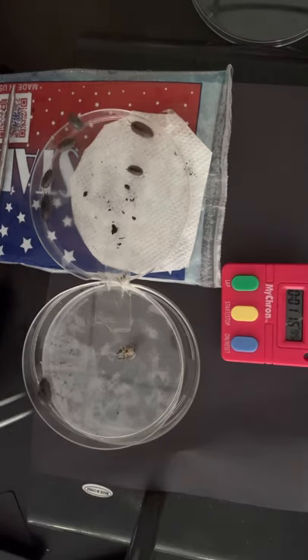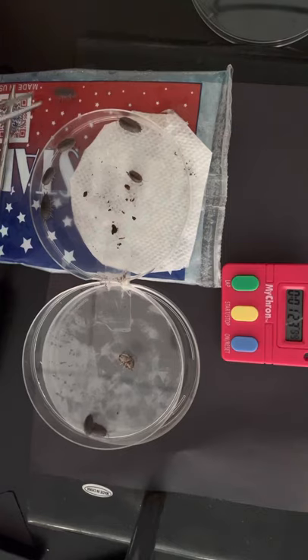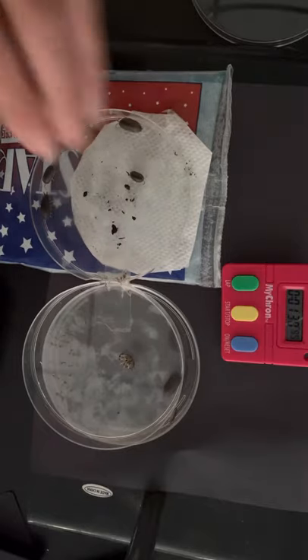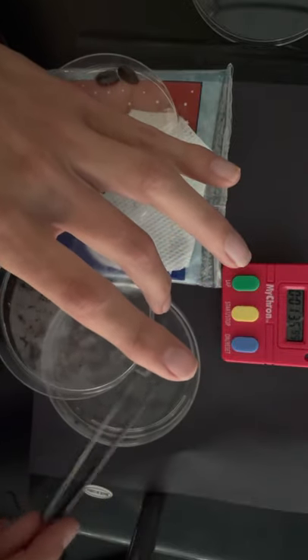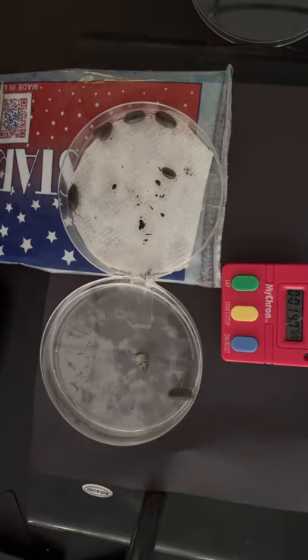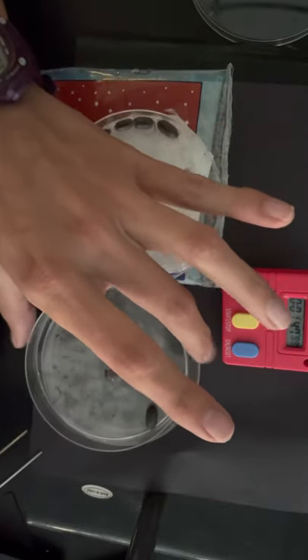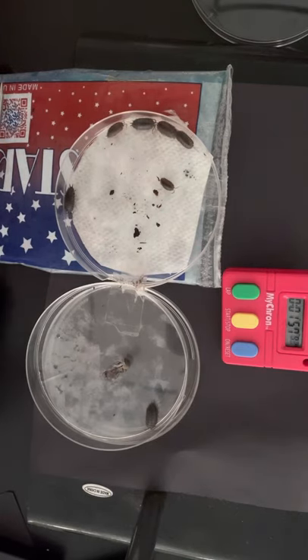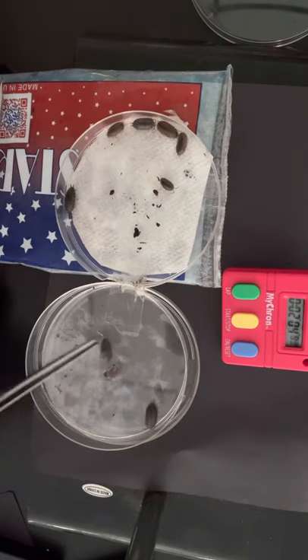One isopod appears to be climbing on top of another. Not sure which side the escaped one came from. One fell into the warm bath — pulling him out now. Count: one, two, three, four, five, six on one side and one, two, three on the warmer side.